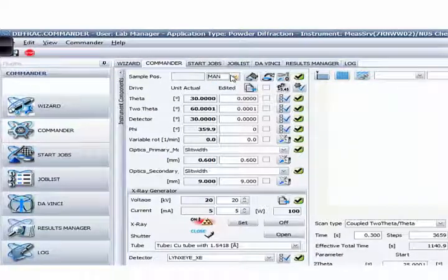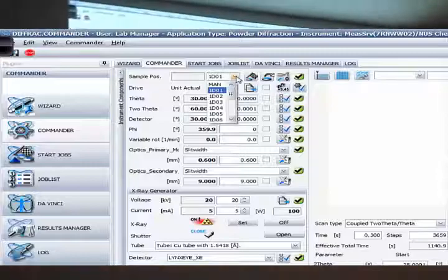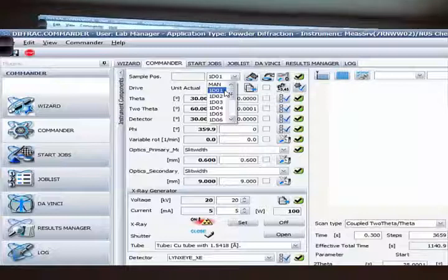Right now you can only see the manual mode here. When you load the sample holder using the sample robot — it has sensors inside — once you load the sample holder in, it automatically detects that there's a sample holder, in this case at position D. So you should be able to see the D row in the sample position list — from D01 all the way to D15 — and you click the position that your sample is at.